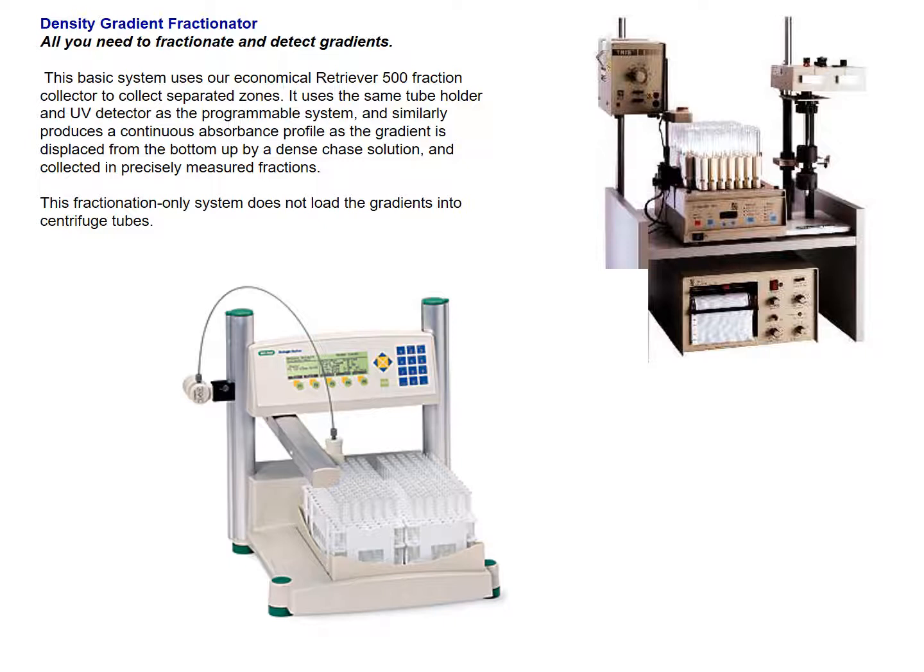Okay. And so here's another fraction collector. Each tube represents a different slice of the fraction. Here's another one as well. So this is a robotic arm, and it moves down the bingo card. If you think of this as a bingo card, what happens if the robot breaks? Then all your fractions end up in one tube. You go down to Corky's barbecue here, and you think this is working, and everything just overflowed. Has that happened to me?